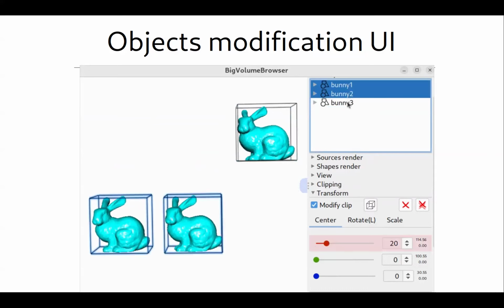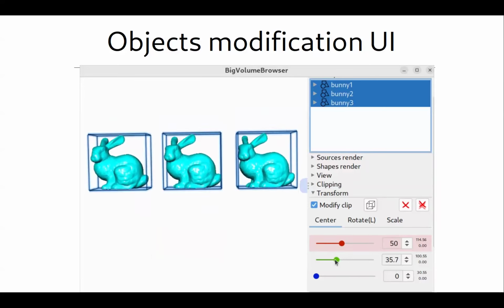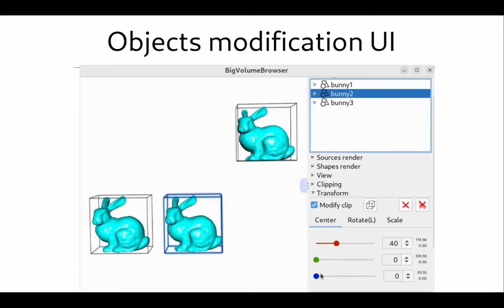As soon as you start to drag the slider, if you interact with the slider, it actually sets all the values to the current value of the slider. It is maybe a little bit not very trivial, but you can just try and play with it and see how it works.